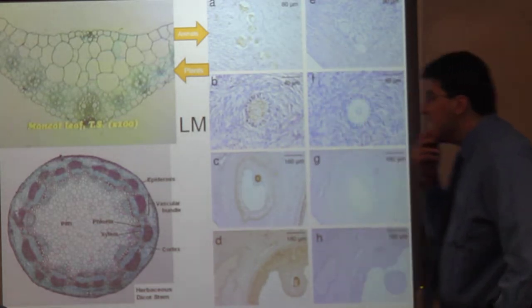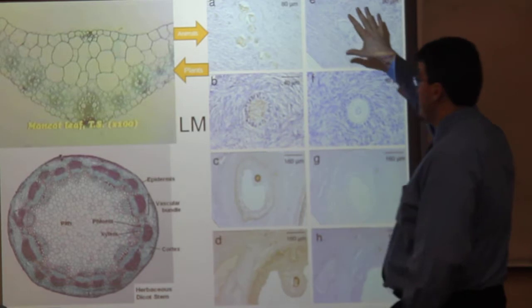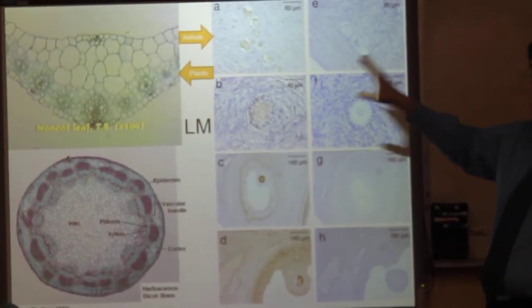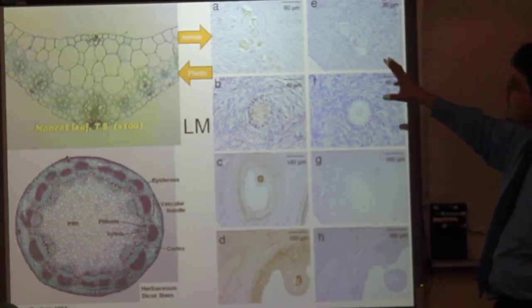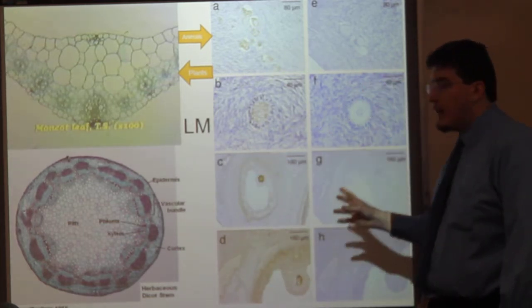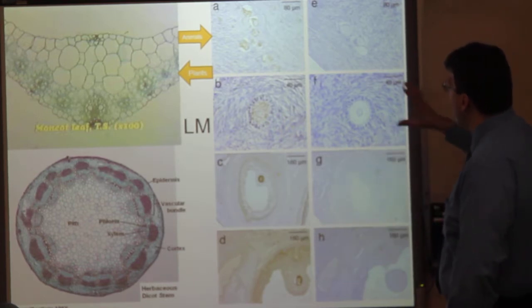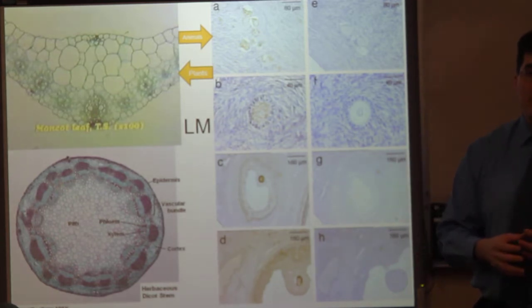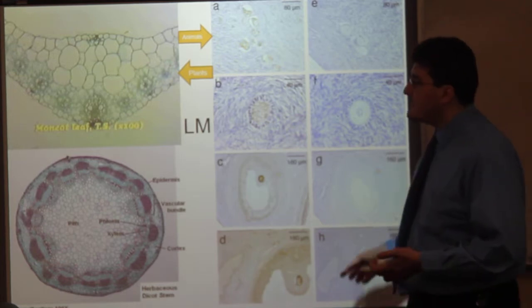Now, this is a light microscope comparison. These are plants, these are animals. You can recognize light microscope images because they are in full color. They are not terribly well resolved. You're not seeing great depth perception. You're not seeing many individual organelles. You're seeing large structures pretty much exclusively, not individual small organelles of any sort.